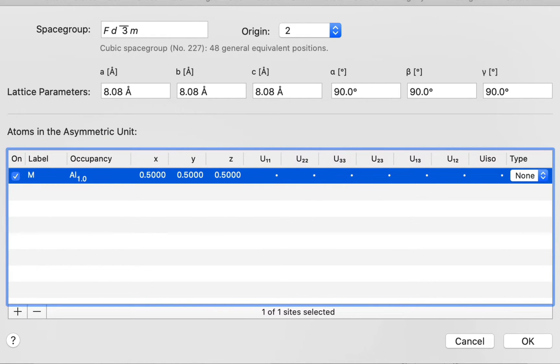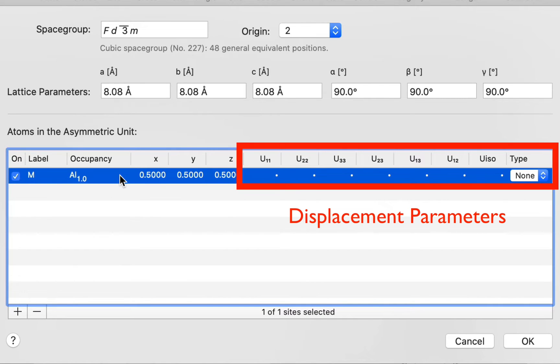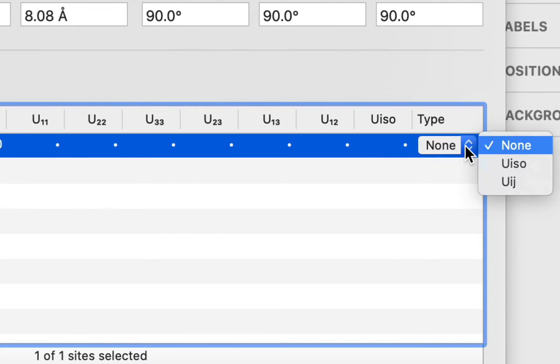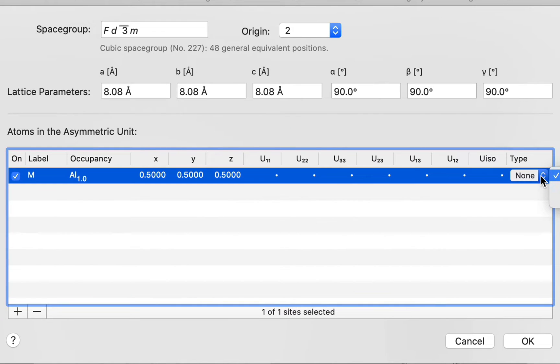Finally we have the option of entering isotropic or anisotropic displacement parameters — the columns U11, U22, and so on. At the far end we have the type: none, UISO, or UIJ. These designate the uncertainty in the exact atomic position, typically caused by temperature — atoms move and are represented by a sphere or an ellipsoid, thermal ellipsoids. We're going to ignore those for now.